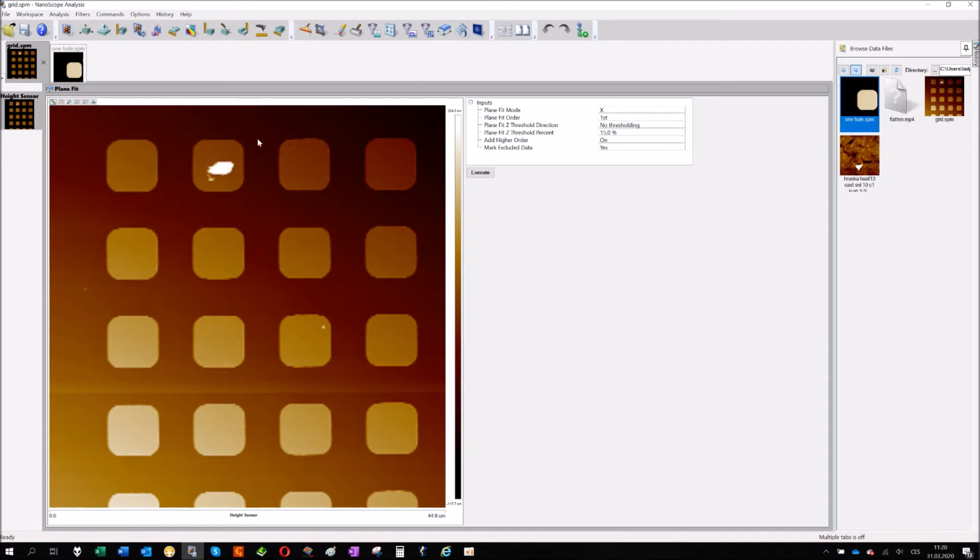How to work with that? Very easily. We have something called the plane fit icon here, which opens a new parameter list. You have two very similar options. One is the order as before. For tilt compensation I will choose the first mode, and then you choose the direction in which you want to compensate the tilt, and in our case I will use just the X.